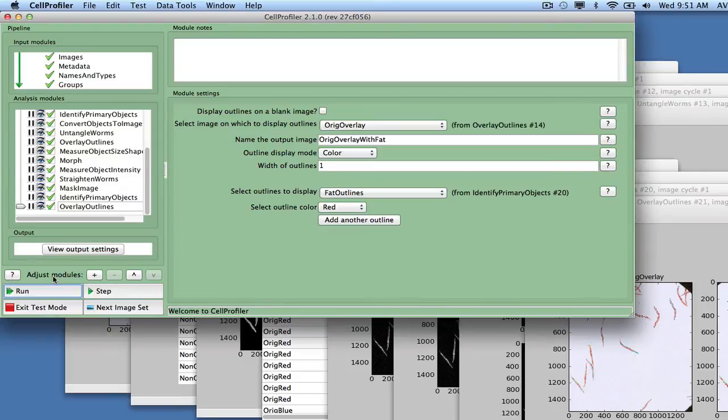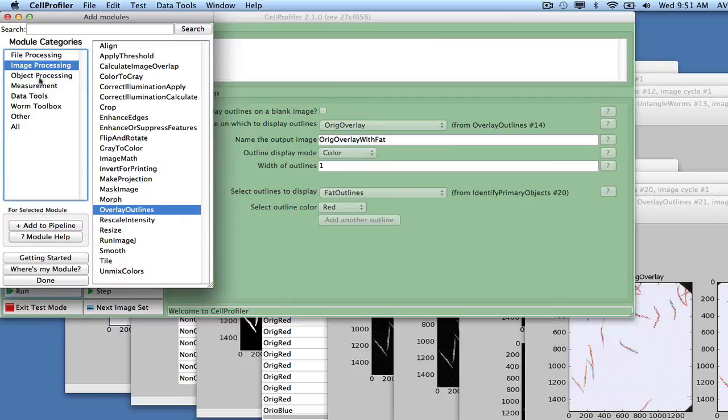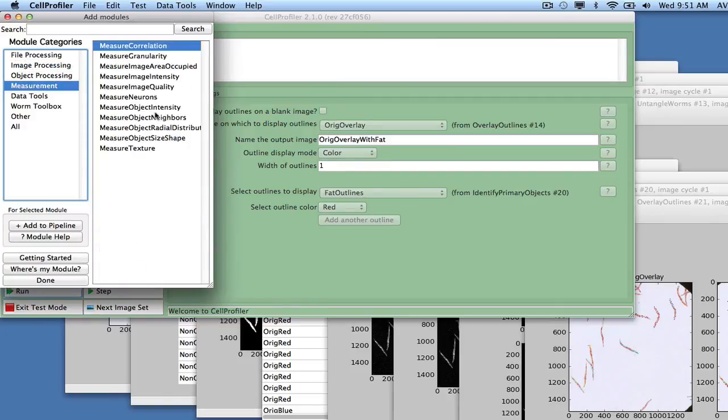Now, extract the shape and intensity measurements from the fat objects by adding the module Measure Object Size Shape, unchecking the Zernike measurement calculation again.